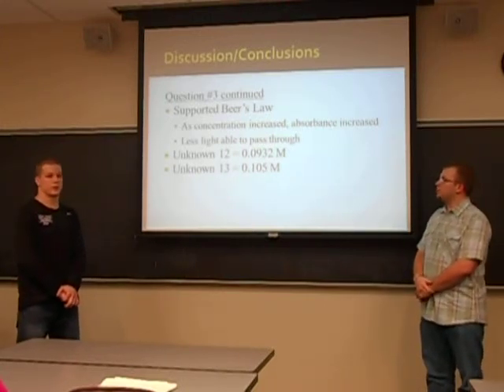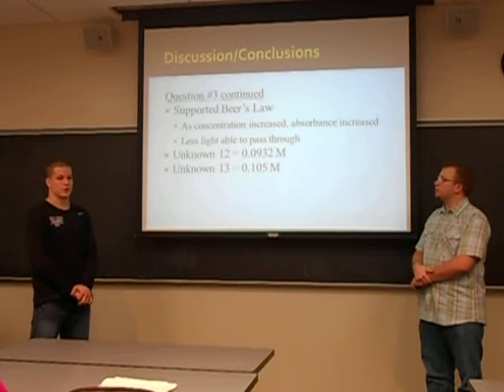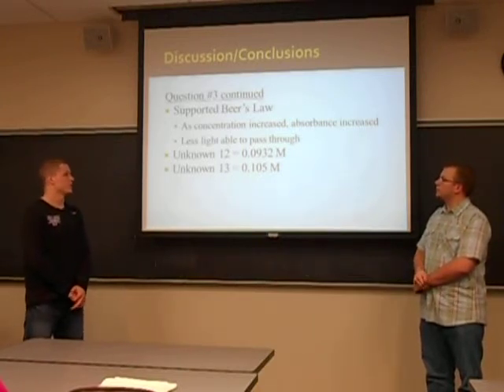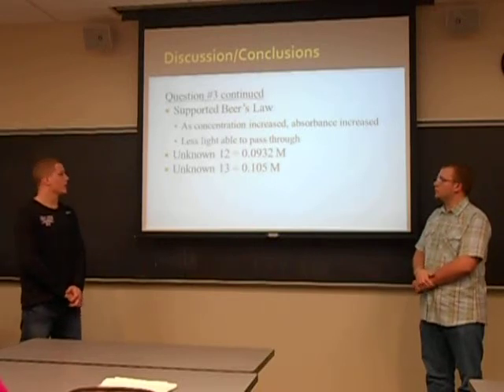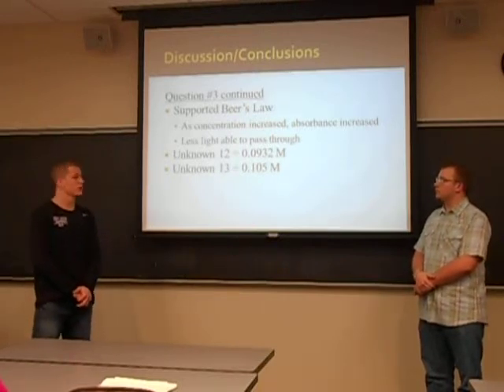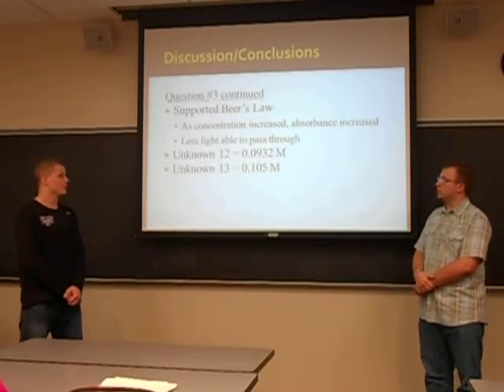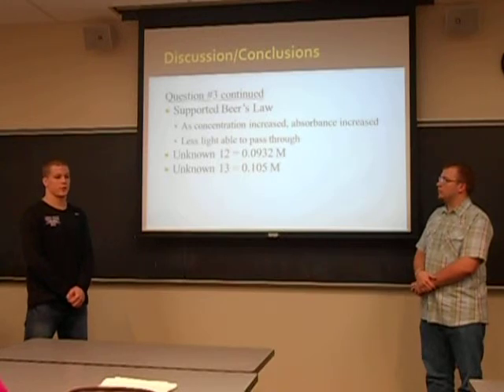We did support Beer's law because absorbance and concentration were directly related. As concentration increased, so did absorbance, and less light was able to pass through. And our unknown 12 concentration was 0.0932 molarity, and our unknown 13 was 0.105 molarity.